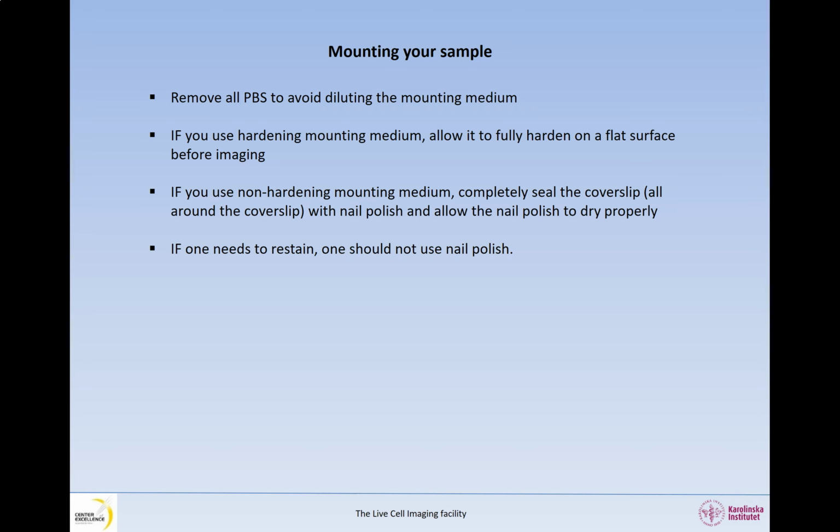If you use a non-hardening mounting medium, completely seal the cover slip with nail polish and allow the nail polish to dry properly. Otherwise, the mounting medium will leak and the objective will be damaged. With non-hardening mounting medium, one can separate the cover slip from the slide and restain the sample. If one needs to restain, one should not use nail polish.